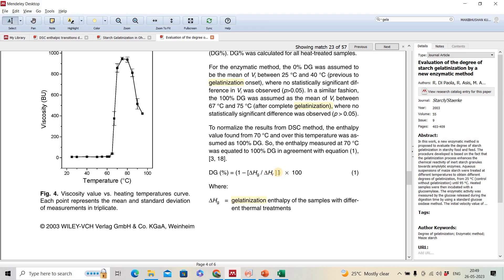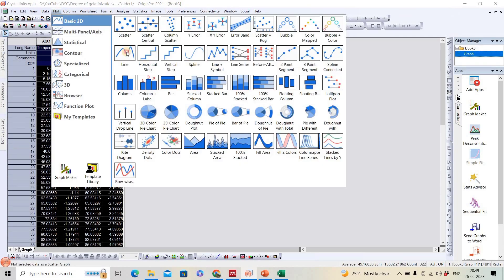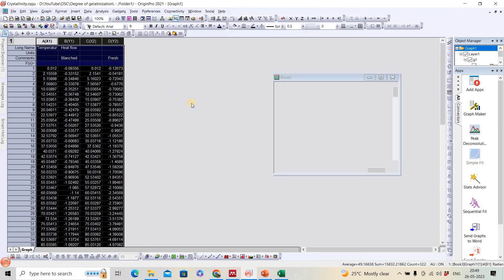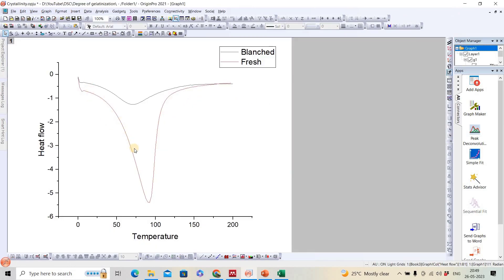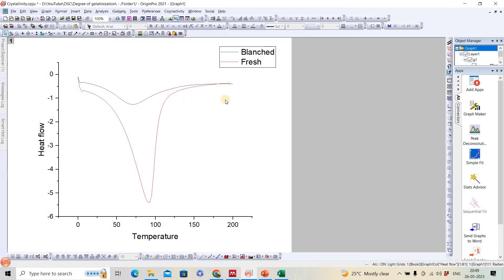Now let's take a practical example to calculate the degree of gelatinization. I have taken a food sample containing starch and blanched it. Blanching causes gelatinization of the starch, which we can see clearly — the enthalpy of gelatinization is reduced significantly in the blanched sample.